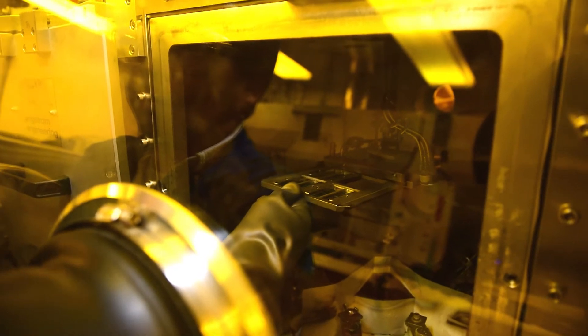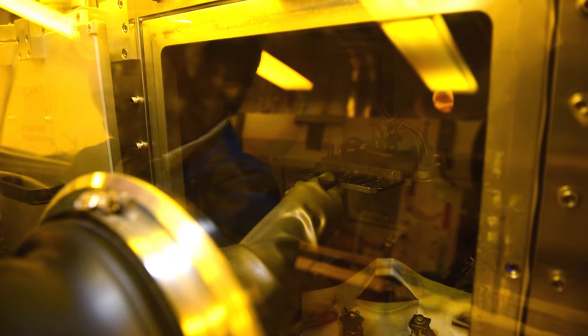For most of my work I've had to make devices which requires that I evaporate at least the contact, if not also part of the active layer. So I've really gotten to know the system.